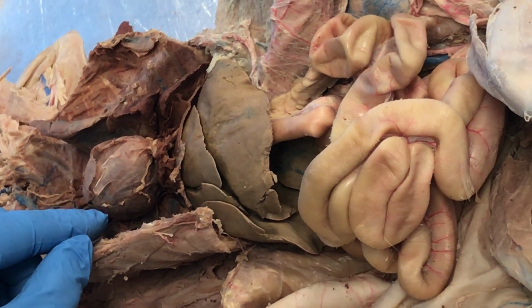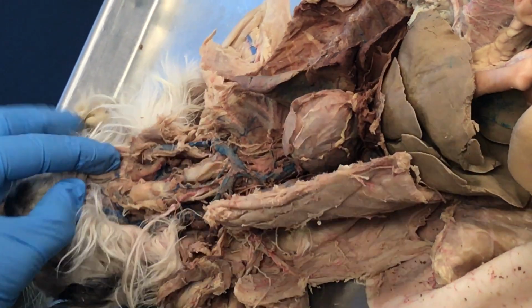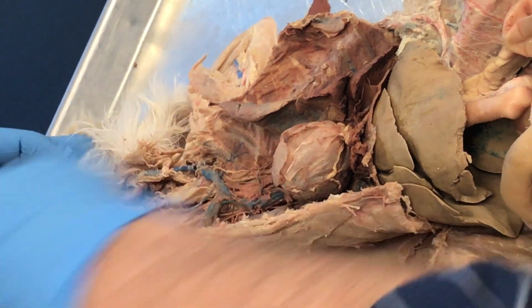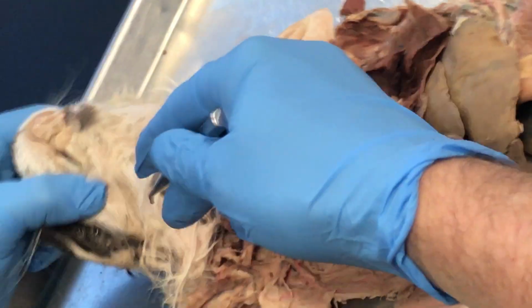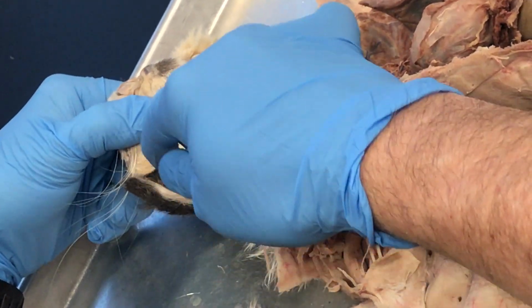Dissect your cat. Describe dissections. Responsible for parotid. So the salivary glands are going to be up in here, and I know they didn't do a lot of dissection, but this actually looks more like a lymph node. We won't be able to tell until we actually get it dissected out. But the parotid glands, the salivary glands, are going to all be up in here. The way I like to describe it is the ear sets here. They're going to set anterior to the ear, so they kind of set in this region.